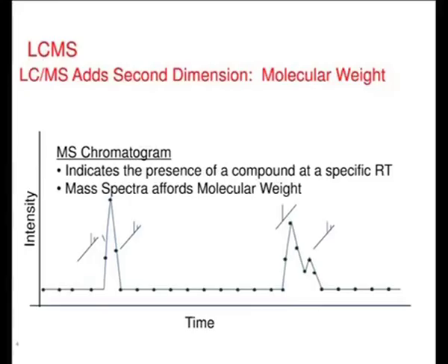With MS, what information are you getting? Not only the retention time, but also the mass spectra, like the mass to charge ratio, and you can do the confirmation. There is also a possibility that two or more compounds eluting at the same retention time may have the same molecular weight. How can you confirm that the peak eluting at this retention time is pure or not?